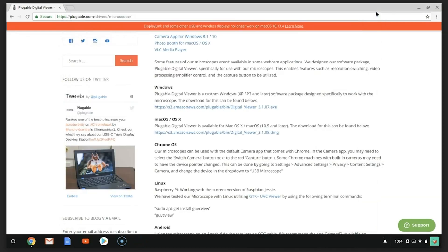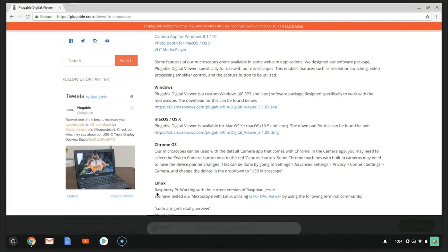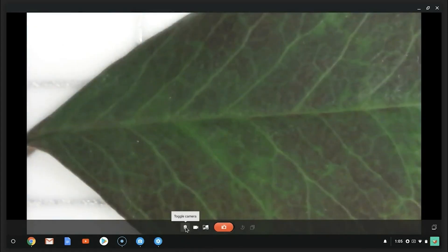Exit out of your settings. Now, access your camera and your magnified object should appear on the screen.